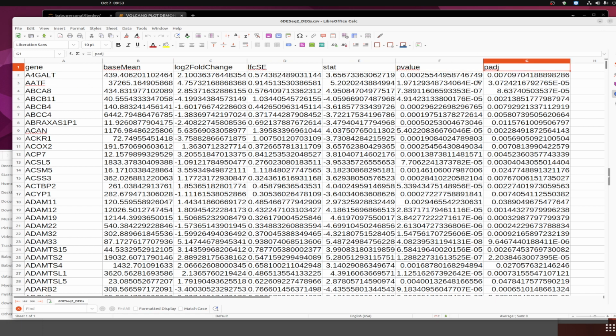So, in these values you can see the p-adjusted values, and we can talk some time about the p-value versus p-adjusted value. And these are the genes in here. So we'll try to pick this up. Sometimes you won't see the gene in the DEG file if it's generated by DESeq2 from bulk RNA-seq; the gene won't be written in here. So if you want annotation, you can just manually write it down in here.